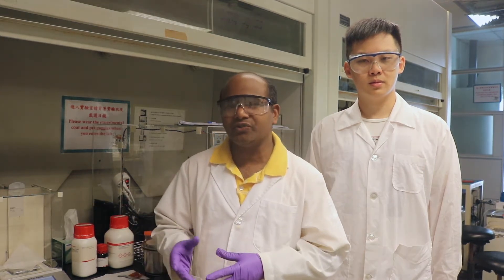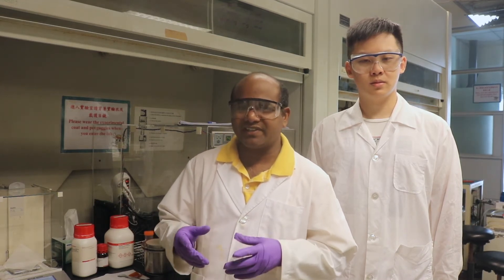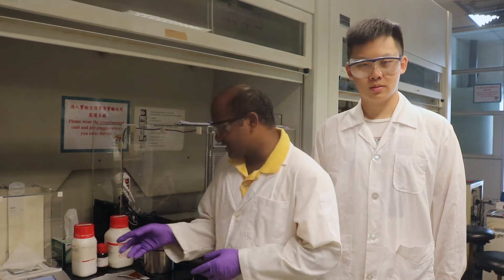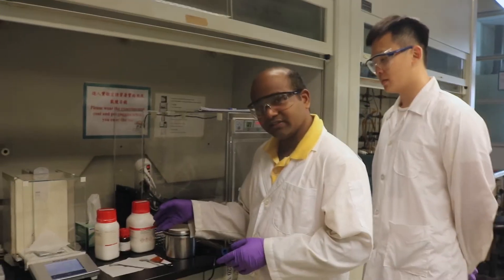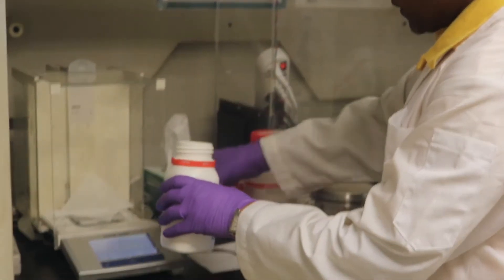Here we are going to demonstrate step-by-step how to synthesize garnet type LLZO and measure the ionic conductivity. These are the starting materials. First, we will weigh the compounds according to stoichiometry.